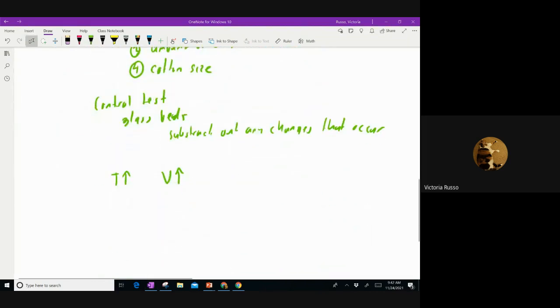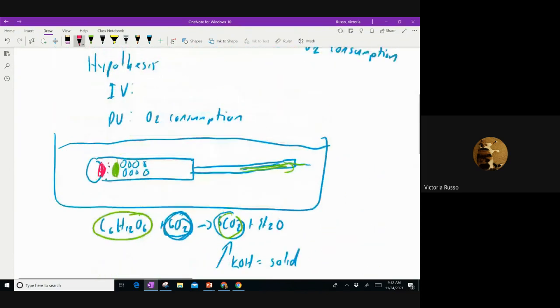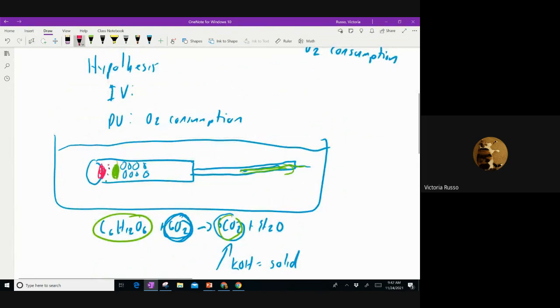If you increase the pressure on a system, the volume decreases. And that can happen in the system by banging into the table and putting pressure into this vial. That's going to make the volume of the oxygen in this tube decrease, and then water is going to flow in, not due to respiration, but due to the fact that you're putting pressure on the vial itself.